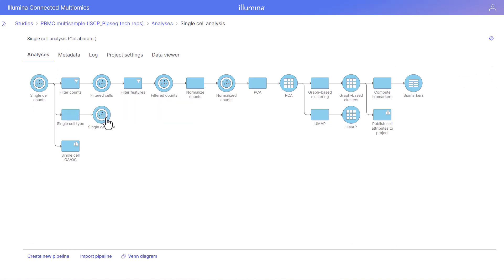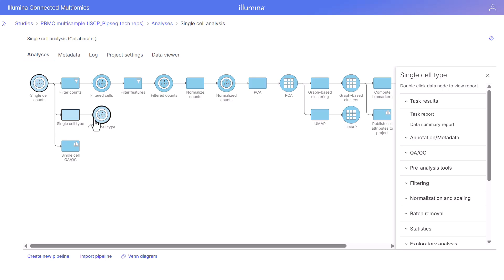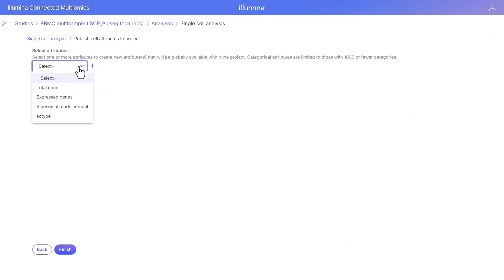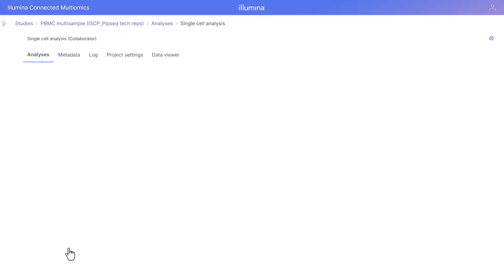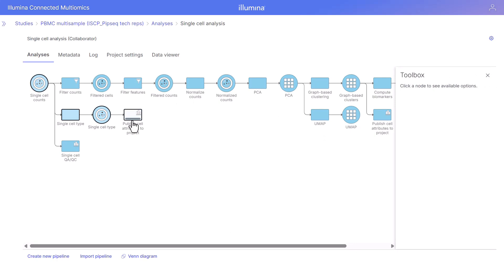The SCType classification is completed. We can open this and view the report for the classification. We can also publish these cell attributes to the project to make them available for downstream use. We'll give it the name 'automatic classification', which can then be used for downstream tasks such as differential analysis. Just like previously, this will be available in the metadata tab under cell-level attributes once completed.